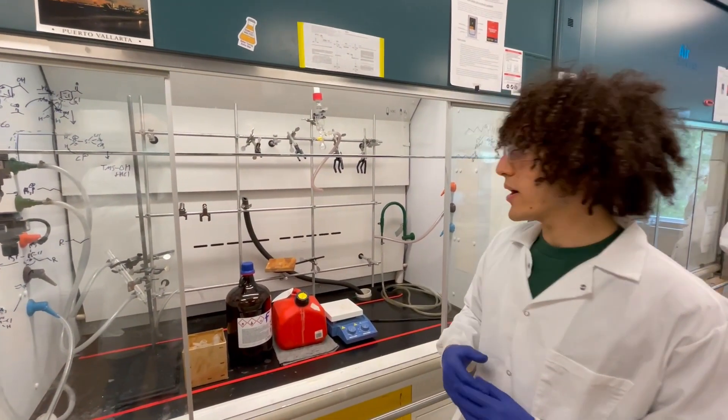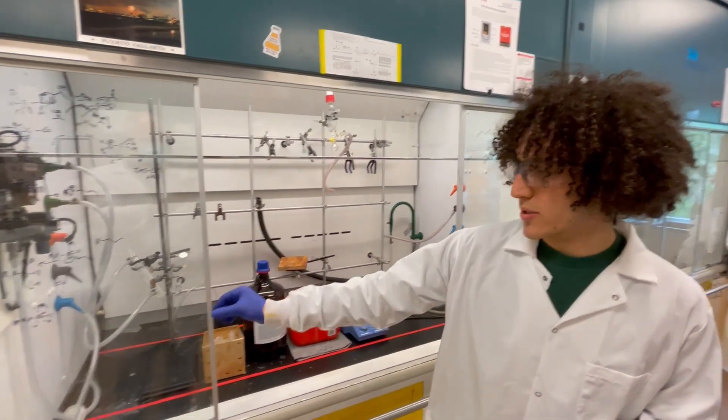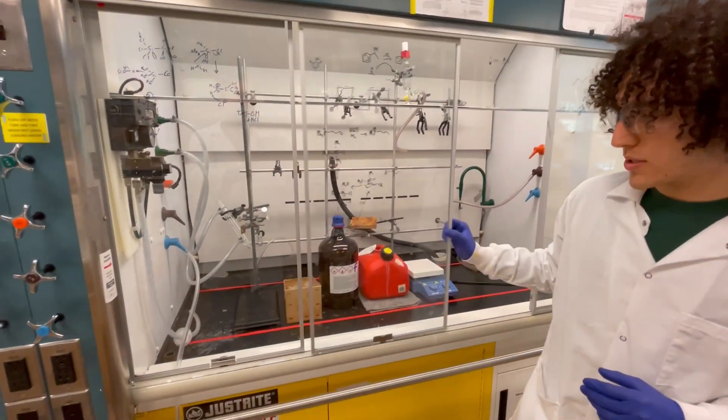The ones generally found in Bond-Wright are high-performance fume hoods which can be identified by their horizontal sashes.